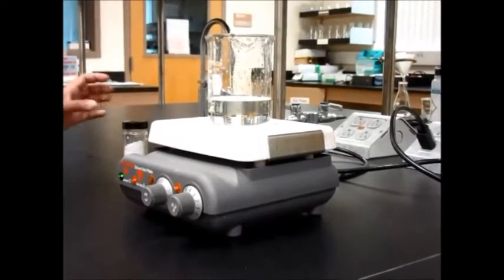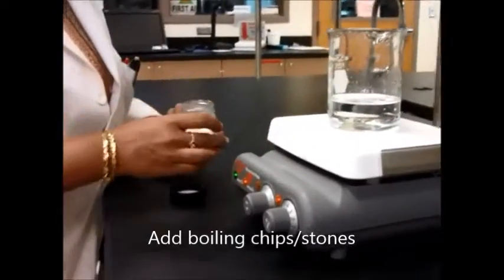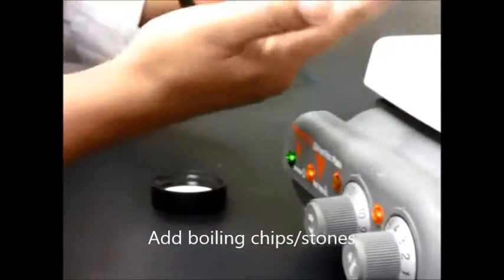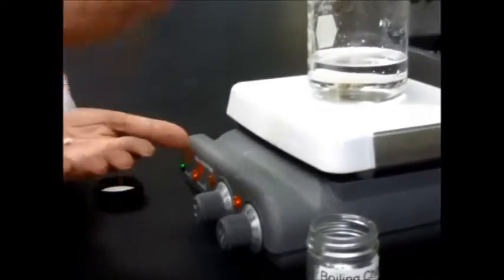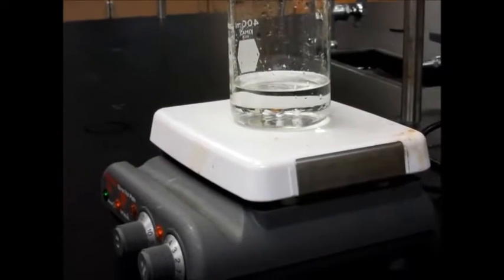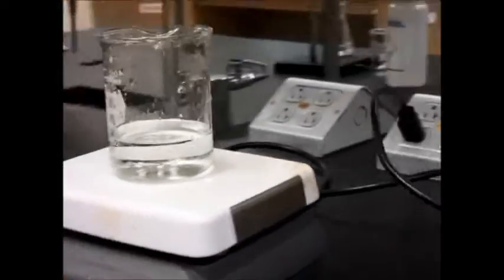There is one important thing: adding boiling chips. When you're boiling water or any kind of solvent, you will have to add boiling chips because they aid in the boiling. Otherwise, the air trapped in the water will come out as a huge bubble. This is what boiling chips look like — small chips. These are Teflon ones; you can also have marble or pumice ones, whichever are available in your lab. Add about two or three boiling chips to promote even boiling.